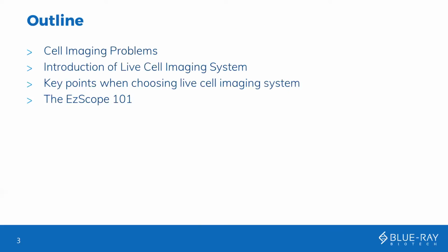I think all of you here are cell-related researchers, and some of you may be familiar with the live cell imaging system, but some of you may not. So I want to start with the concept in this part, and hope to provide you with a few key points for choosing the system.